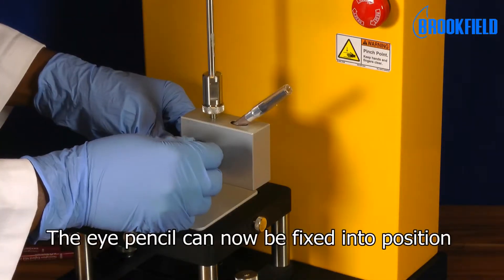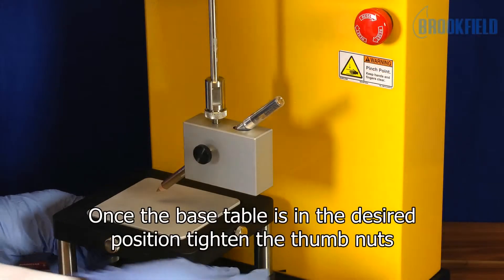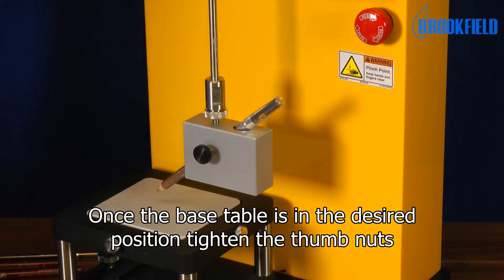The eye pencil can now be fixed into position. Once the base table is in the desired position, tighten the thumb nuts.